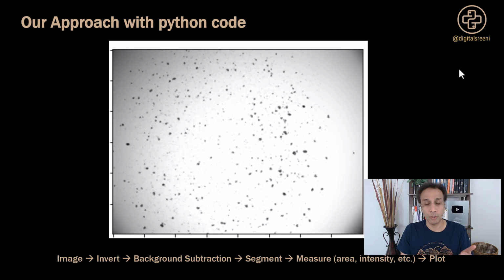There are many ways to work on this, right? You can directly train a deep learning algorithm on these images to detect these small objects. These are all organoids, by the way. So detect these, but I don't want to train any. I want to find the easiest way to get to the result. And for that, doing some traditional pre-processing of images can definitely help you.